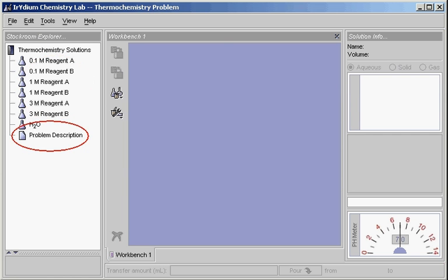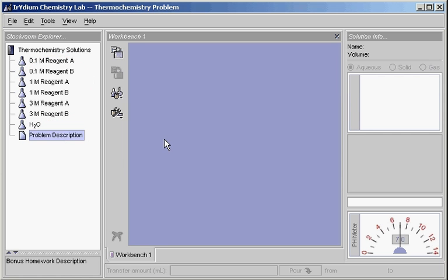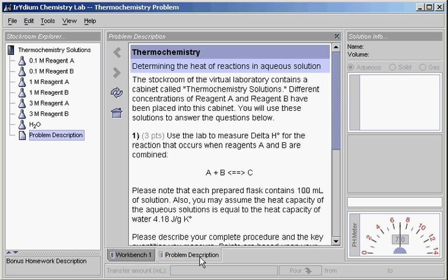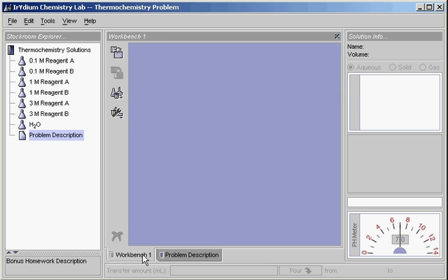The modified chemical stockroom and homework description appear in the stockroom explorer. Double-click on the problem description or drag it out into the workspace to view it. It creates its own tab on the bottom, and to switch between workspaces, click on the tab.